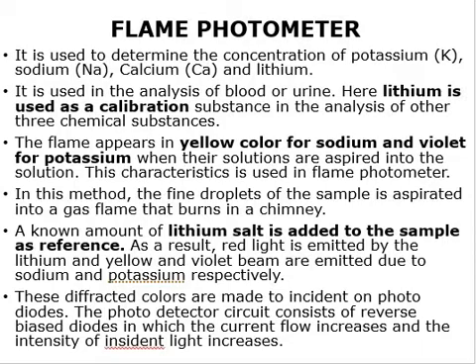Next, what about the color of the remaining substances? We found out that lithium will burn in red color. And what about the color of sodium and potassium? Sodium will glow in yellow color and potassium in violet color. How can we keep in mind that sodium is yellow? Very simple.